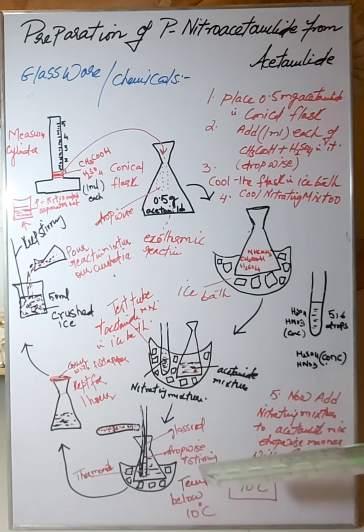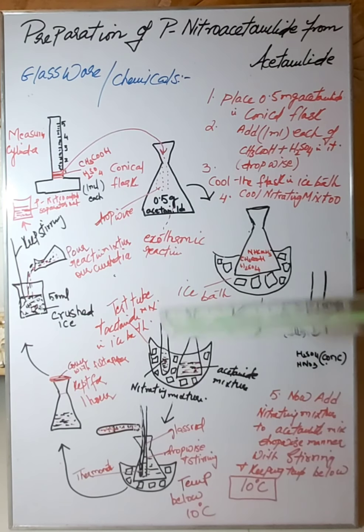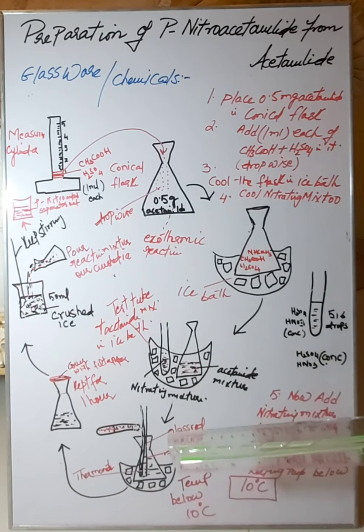There is no rush. I'm repeating, there is no rush when you are mixing any two compounds, any two organic solvents, or any two acids. Please always follow a dropwise manner. Do not rush, or do not mix them with speed. Speed is not needed here, right? So you have to follow each step, and if you follow all these steps, you will achieve a beautiful product.